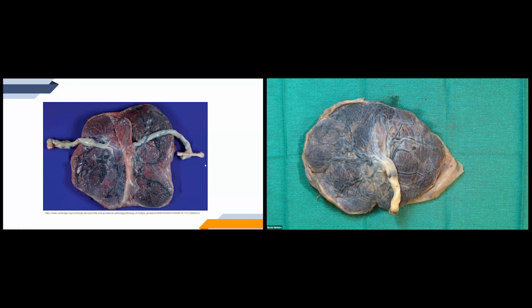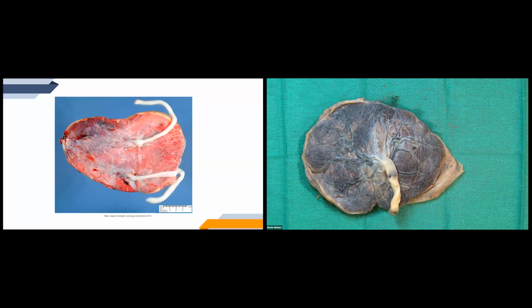This next image here is showing an example of mono-di. So this is showing one placental disc, two amniotic sacs, and a thin translucent dividing membrane. The last image here is showing an example of mono-mono. So this would be one placental disc and one amniotic sac.